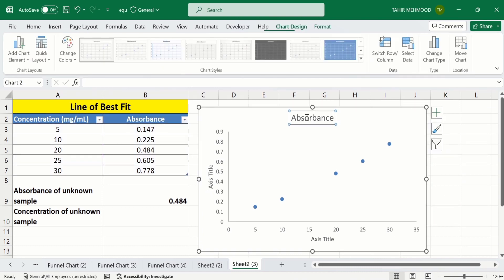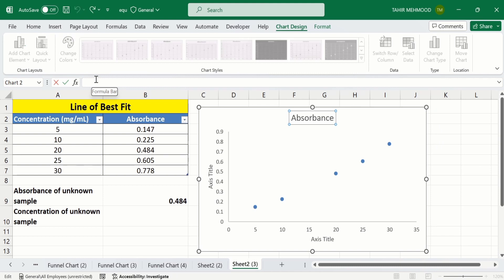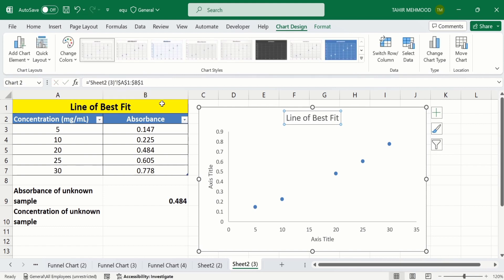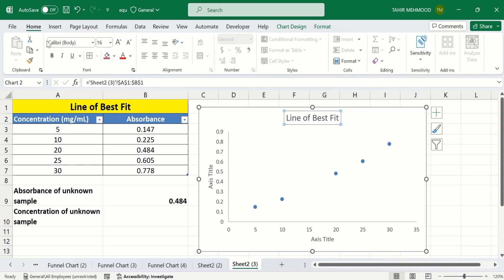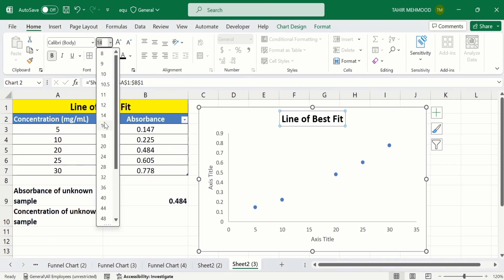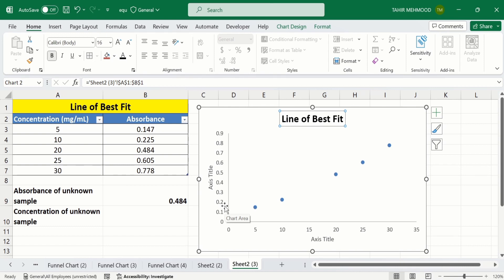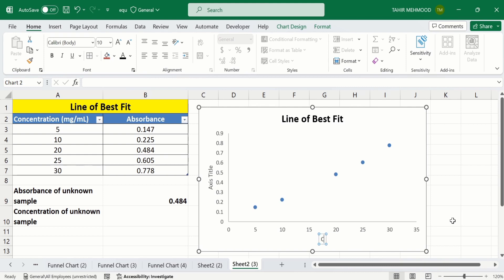Click on the chart title, put an equal sign in the formula bar, and select the cell which contains the value — I want to write 'Line of Best Fit'. Press Enter, go to the Home tab and format it according to your requirement. After that I will change the axis title: one shows the concentration and the other shows the absorbance.